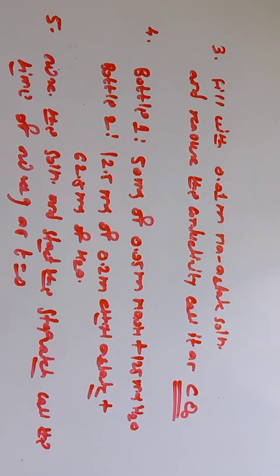You don't take any aliquot of another mixed solution; you take the aliquot of the reaction mixture only once and measure the conductance with the conductometer within half an hour.